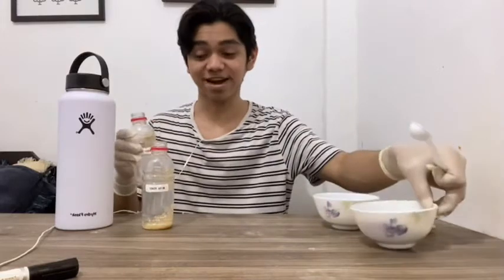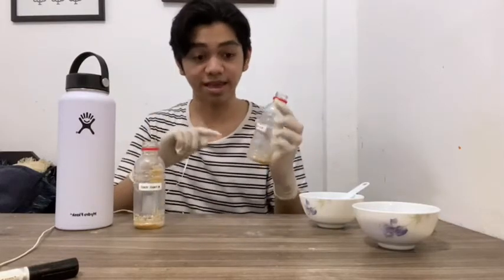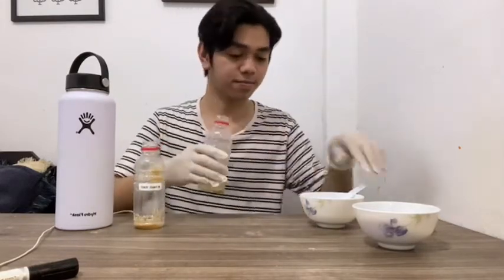And then after that, we're going to add 3 teaspoons of yeast to our bottle labeled with yeast.